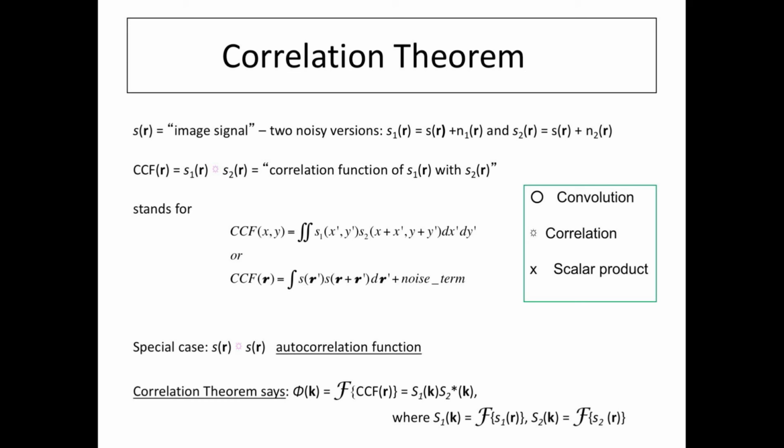That would be the situation if we take two images of the same area, one after the other. Then we would have this situation, and then we want to locate exactly the same molecule in the image field. Then we would do this here, S1 correlated with that one, and what we would get is a cross correlation of the signal underlying both plus a noise term. That noise term is simply a wash. There's nothing there, no significant contributions from that.